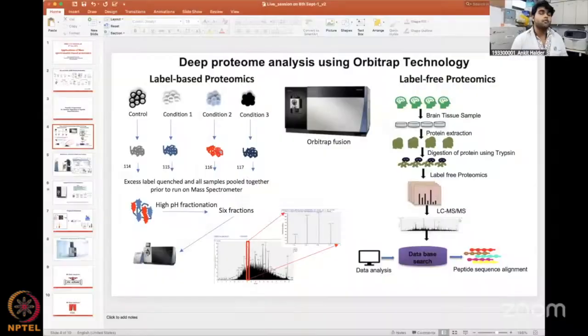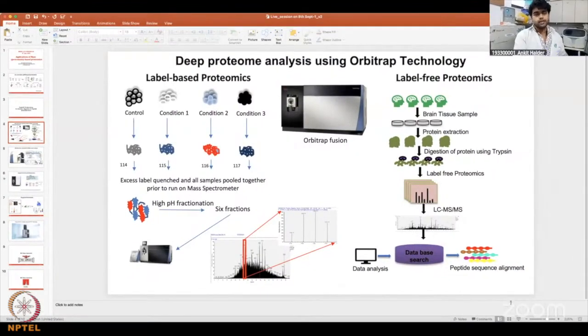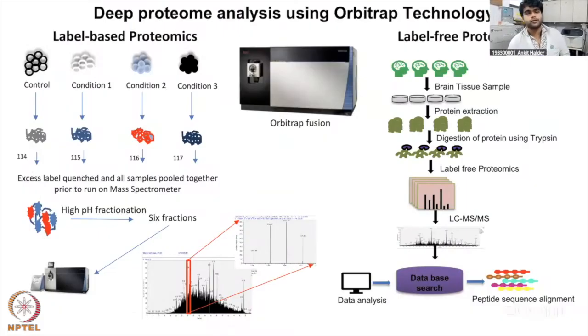You can also see how much peptide is there. And based on the concentration of the peptides, you can put the samples into the mass spec, and you can go for any kind of global proteomics acquisition. So this is for the in-solution digestion and the peptide quantification. Okay, so now I think the samples are ready.